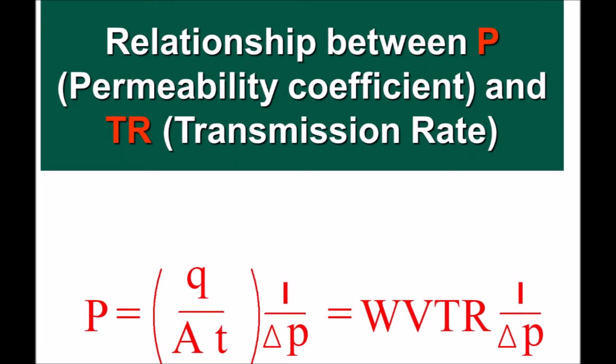The transmission rate numbers obtained in the steady state are converted into the permeability coefficient. The transmission rate numbers can change with varying thicknesses of the polymeric film and the change in the pressure difference between the permeant side and the carrier side. To normalize for the thickness and to account for the pressure differential between the two sides, the permeability coefficient is calculated.